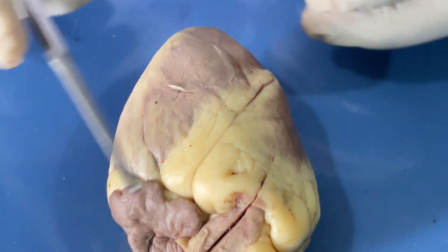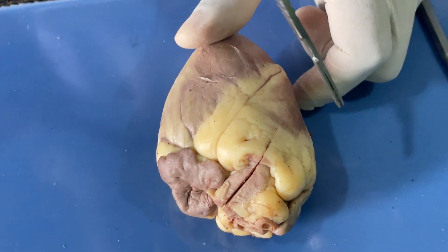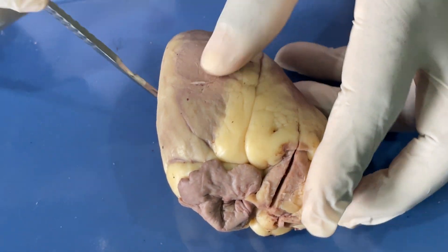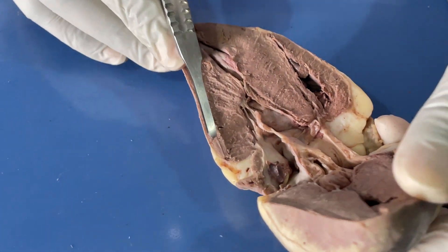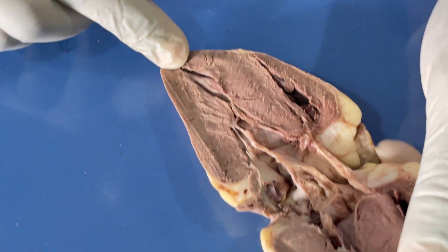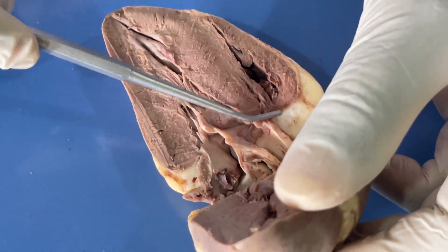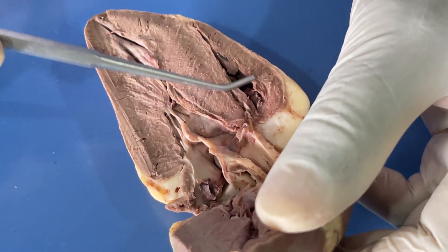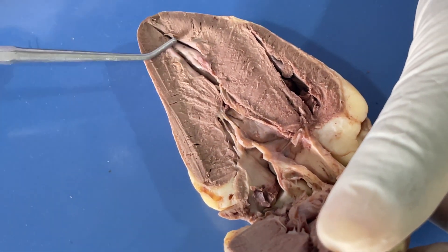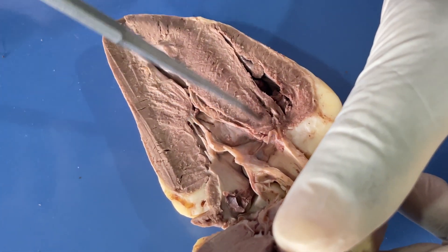Now we can turn it anteriorly and observe the internal structures. Before you do that, you need to cut the heart — you pass it through from the apex to the base. This is done to save us time. So now let's observe the internal structures. Once you have the heart open internally, we have the four chambers: you have the right atrium, right ventricle, left atrium, and left ventricle.